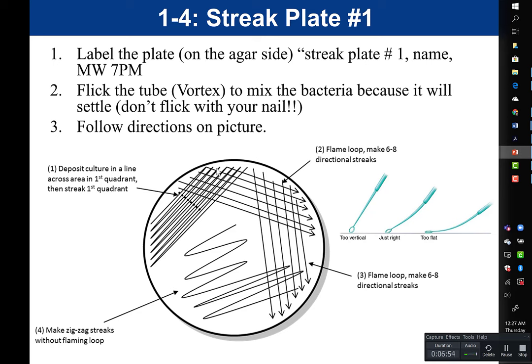To get less and less bacteria in each quadrant, we start by vortexing our liquid culture. Vortexing basically means mixing the bacteria. You push with your finger to make the tube vortex — we don't use a machine for day-to-day vortexing. We don't want to flick the tube with our nail, because there's a possibility of losing control of the tube and causing your broth to go everywhere.